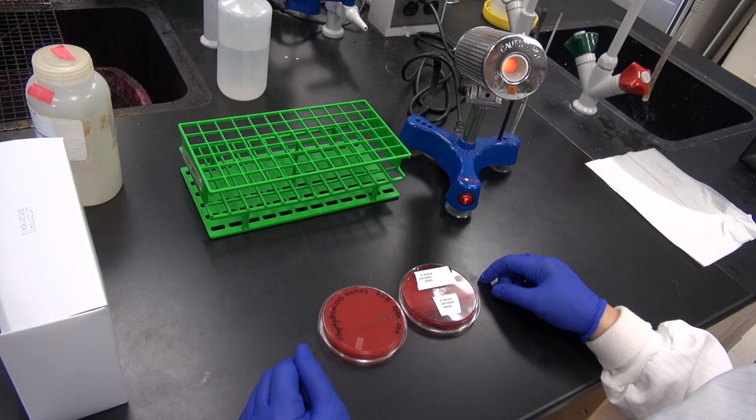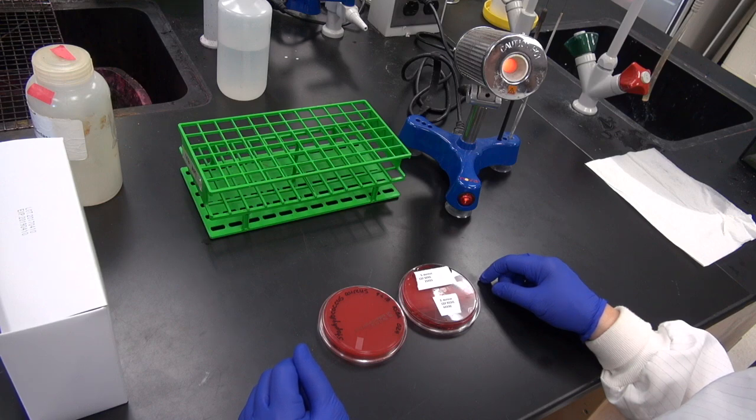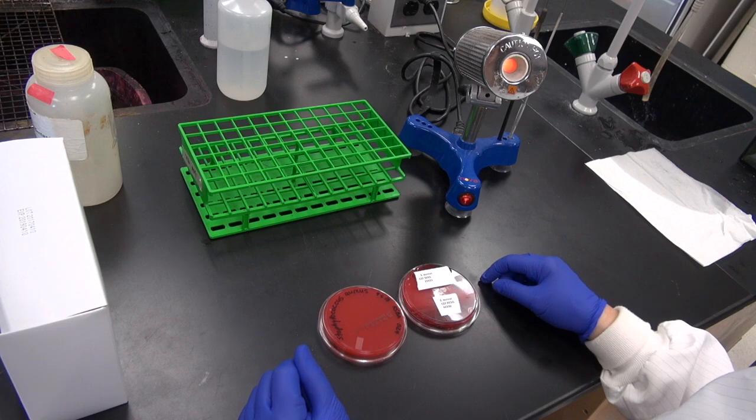For this exercise we will be transferring some bacteria from a culture plate to a new fresh blood agar plate. We will use the four quadrant streak technique to obtain isolated colonies on this new plate.